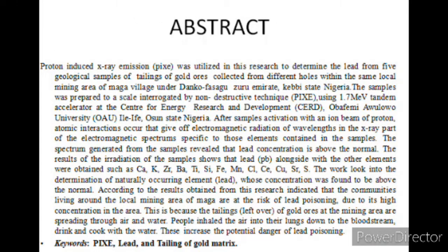Abstract. Proton-induced X-ray emission was utilized in this research to determine the lead from 5 geological samples of tailings of gold matrix collected from different holes within the same local mining area of Maga village under Danko-Fasagu, Zuru Emirate, Kebbi State, Nigeria. The sample was prepared to a scale interrogated by the non-destructive technique PIXE using a 1.7 MeV tandem accelerator at the Center for Energy Research and Development, Obafemi Awolowo University, Ile-Ife, Osun State, Nigeria.